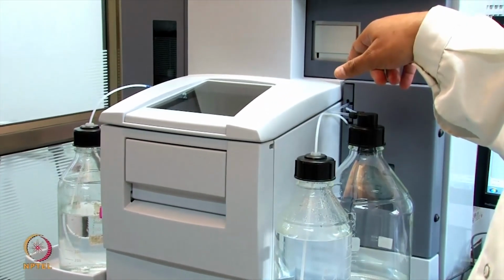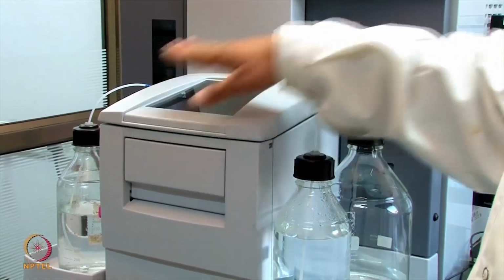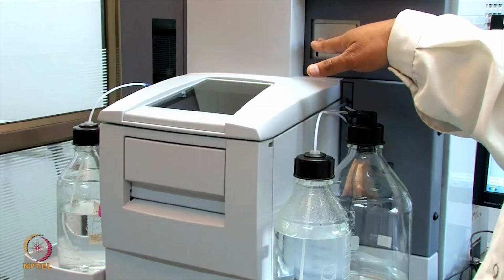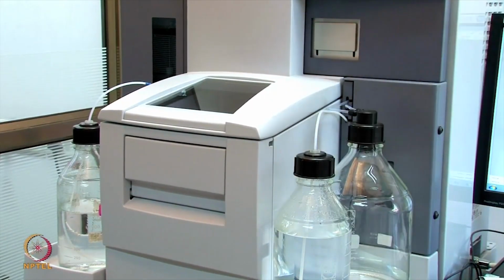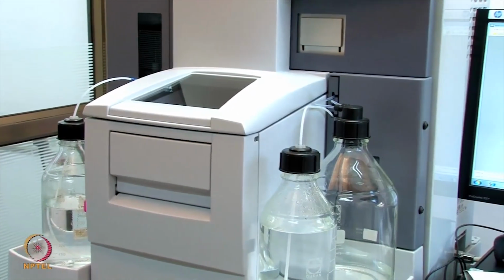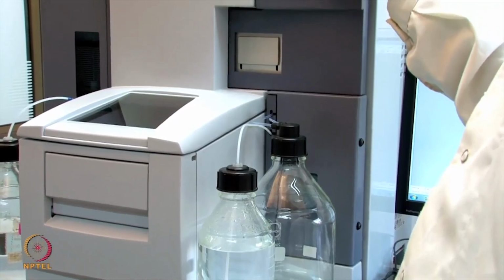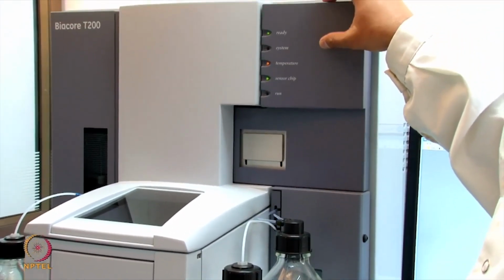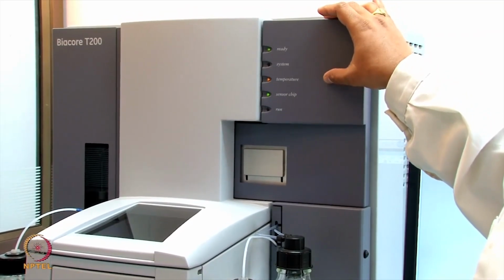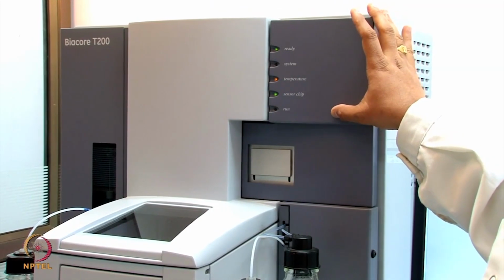So the experiment starts by picking up samples from this compartment and transferring them here at the interaction site, and then the experiment is recorded on the screen. Here are some kind of indications are provided. When the machine is ready or the system is calibrating the temperature, when the new chip is docked and the run is actually happening.